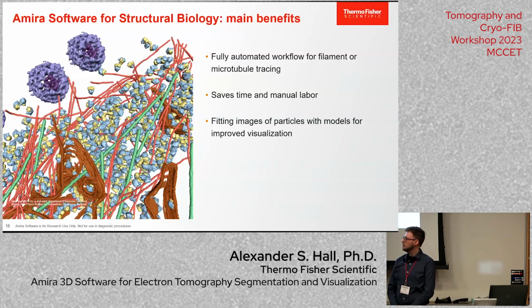Yes. I was pretty light on the measurements discussion in my talk, but that's what a lot of people use Amira for. It ends up being very specific to each person's use case. So the kind of spatial 3D measurement is definitely possible in Amira. Right now, those nuclear pore complexes are interpreted by Amira as molecular models that were converted into surfaces. So the surface is a discrete point from which we can cast a distance field out.